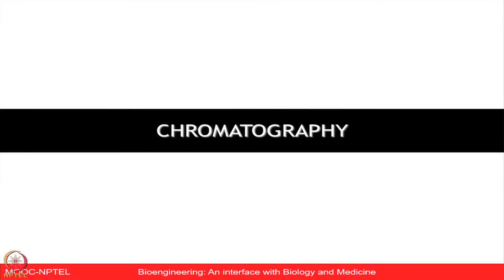So, let us talk about what is chromatography. Chromatography broadly is a collection of lab techniques which carry out the separation of complex mixtures by making use of the inherent properties of the components of the mixture.